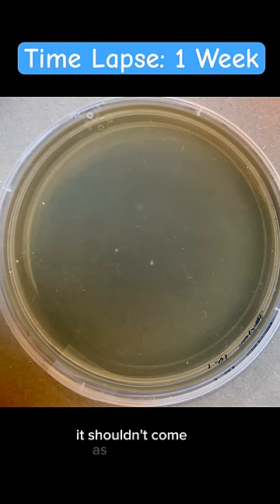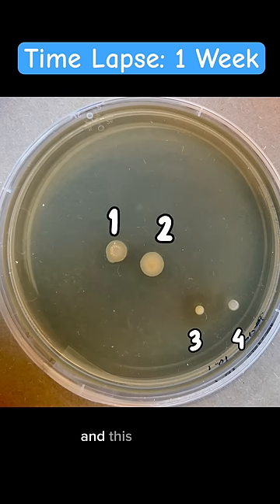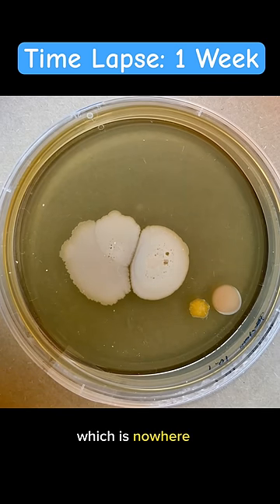It shouldn't come as a surprise that gas pumps have bacteria, but here we only see 4 CFU, and this plate is at a 10 to the negative 1 dilution. So these 4 CFU really represent 40, which is nowhere close to millions.